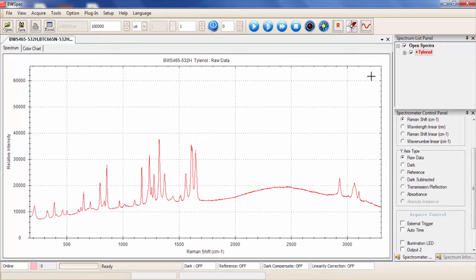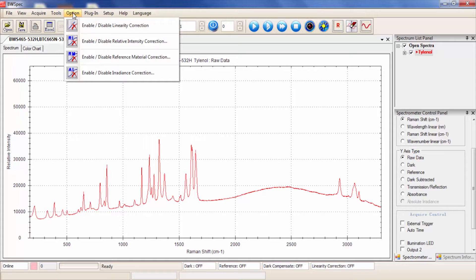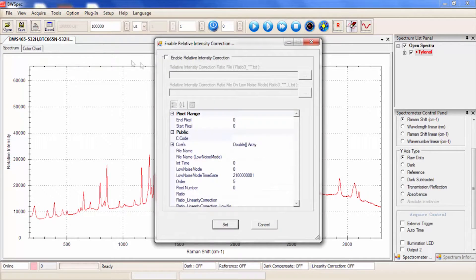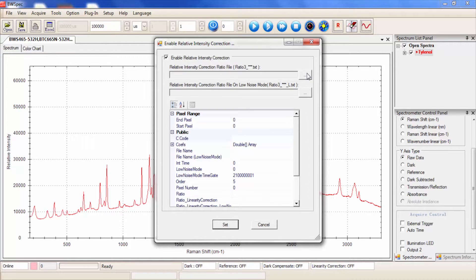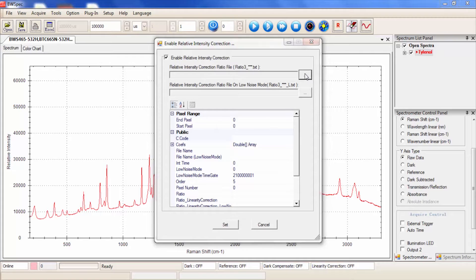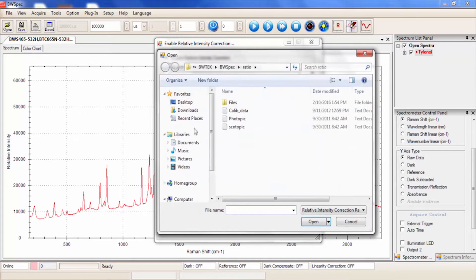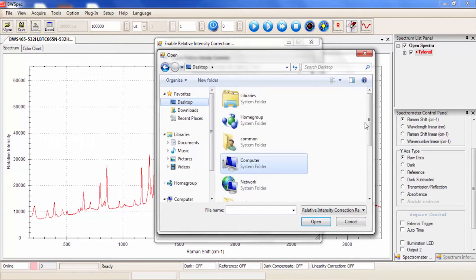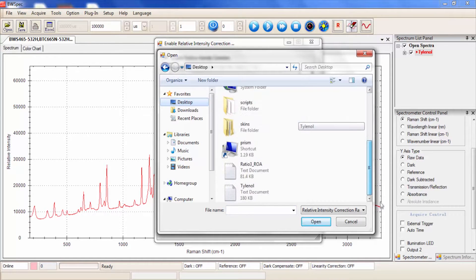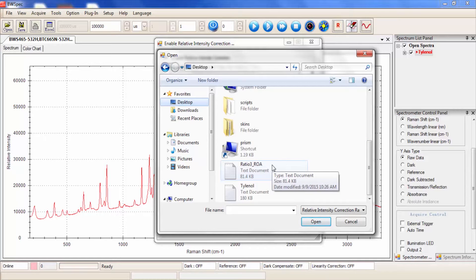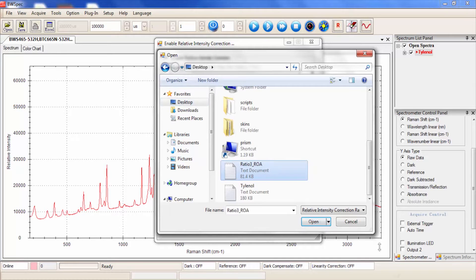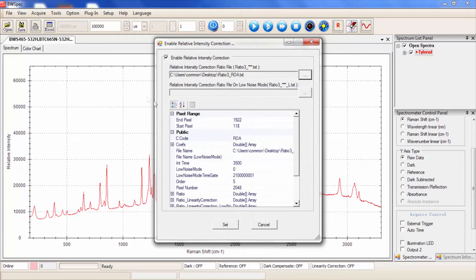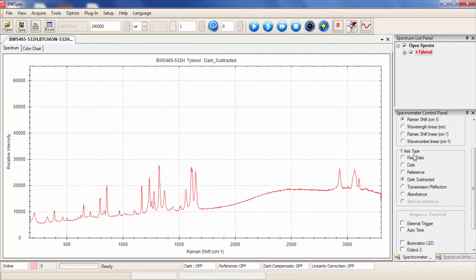Here I will show you how to enable Relative Intensity Correction on this Tylenol spectrum. First go to Option, Enable/Disable Relative Intensity Correction. Then you would find the Relative Intensity Correction ratio file. For us, this ratio file is found on the desktop. This ratio file will also be found on the USB drive that was shipped with your iRaman Plus. As you can see, the shape of the waveform transformed from when it was enabled to disabled.